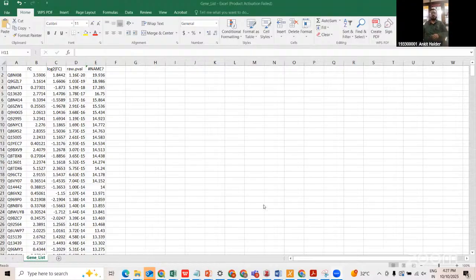Yeah, so when we are talking about, as Sarah has already shown, the different proteogenomics analysis, we do genomics, then we are getting protein, and we understand that there are different levels of mutations, followed by the different protein expression and the different effects of gene changes, and all are reflected in the protein. So now once we are aware that we have got the proteins, and we have done the secondary analysis.